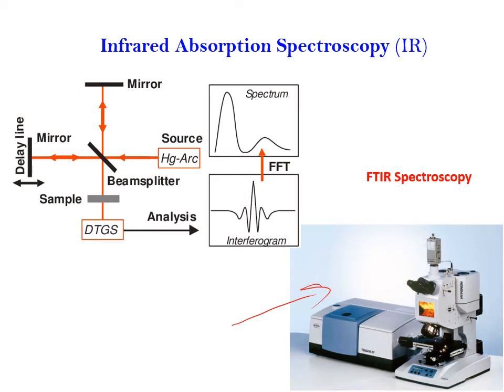The principle is the same. There is light source, there are set of mirrors or beam splitters, there are detectors, there is analysis. The analysis converts the detected intensity or absorbance versus wavelengths to the interferogram that converts to Fourier transform, and the spectrum will be generated.